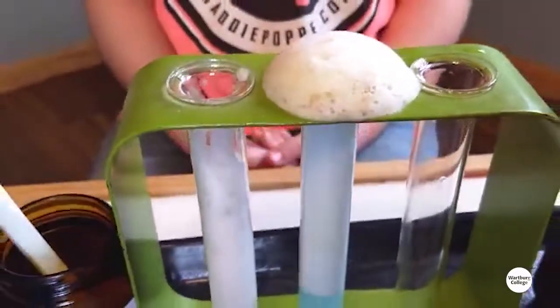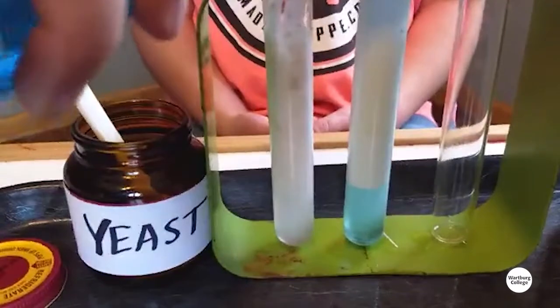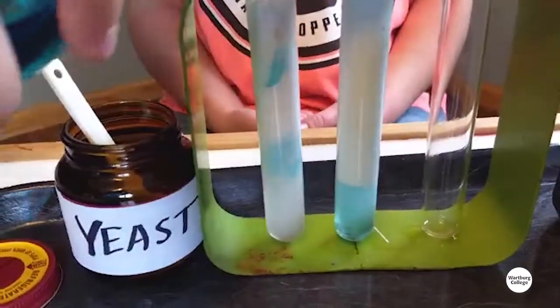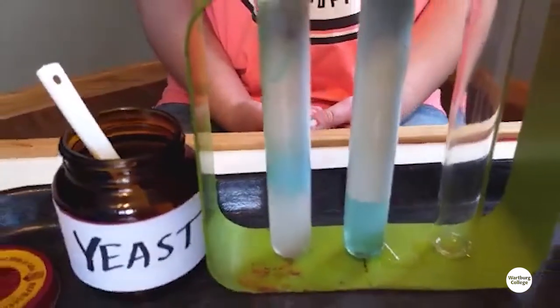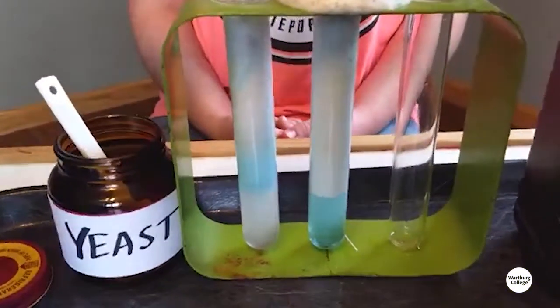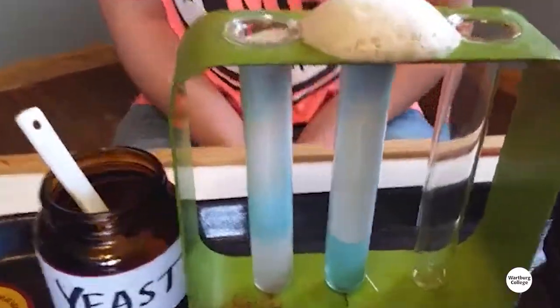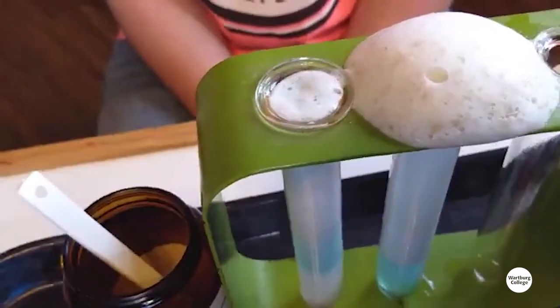Look at that! Can I put some soap in later on? You could put in soap later on — see what happens when you do it. Oh goodness. Please share your videos with us. We want to see what's going on. Look at it growing!